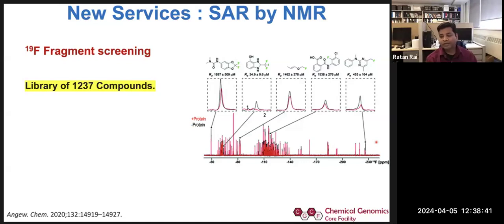Yes. So even what we are doing over here, we are trying to find one molecule, but definitely, in silico modeling is really good, and you can screen even millions of compounds quite easily. But definitely you need some biophysical proof of how it interacts in an actual scenario.